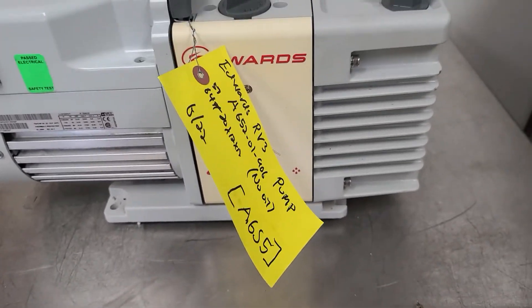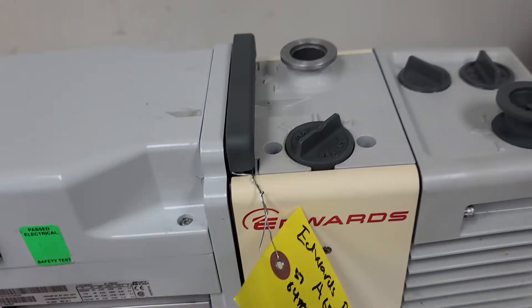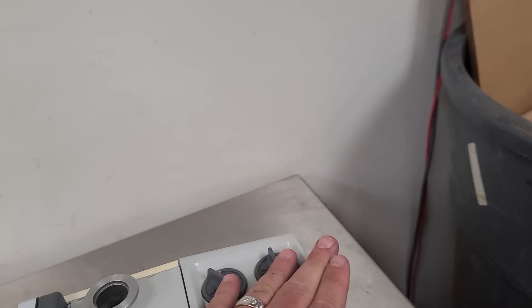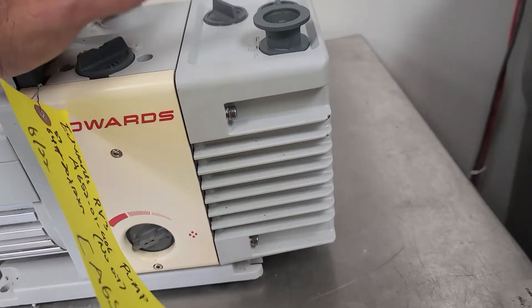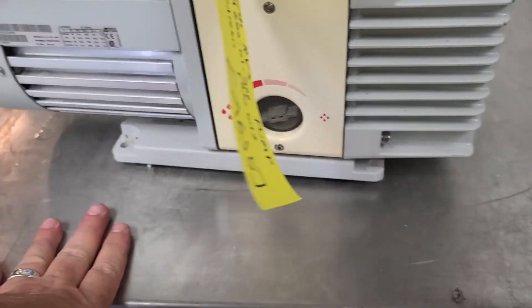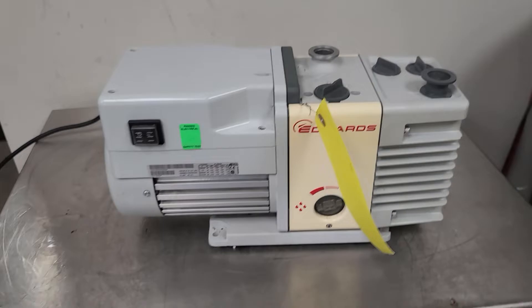It's sitting on a scale, so that's what you're hearing. If I put my hand down on the scale, that doesn't do it. Nothing to it. That's the unit.